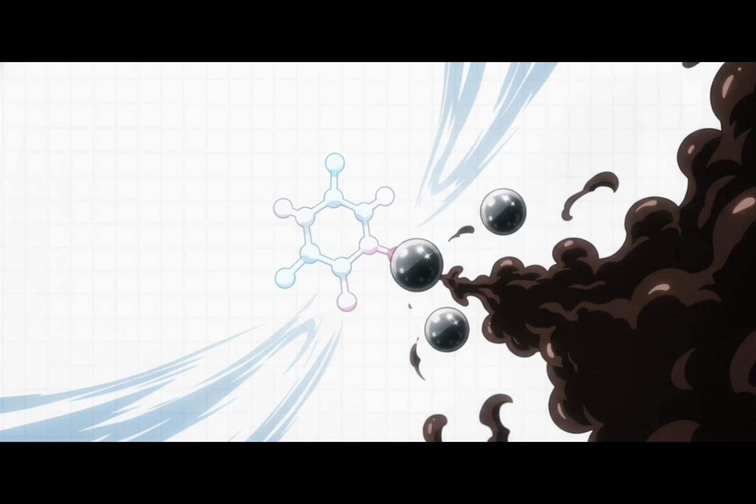Now, this brilliantly illustrates the dramatic visual climax of the chemistry. That leftover byproduct, esculetin, is highly reactive. When it leaks into the surrounding agar, it acts like a magnet for iron. It binds right to the ferric ions, the Fe3+, that we've intentionally seeded into the media. When these two meet, boom, they form a phenolic iron complex that turns a dark brown or jet black color. That color change, that is the definitive chemical footprint we're hunting for.